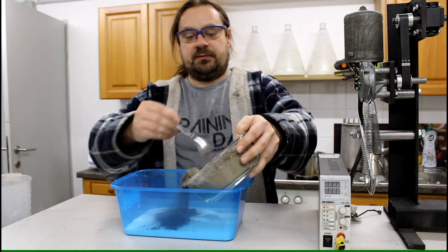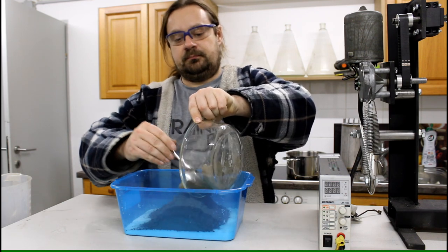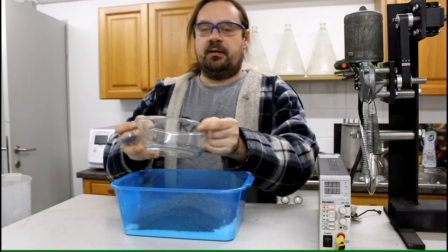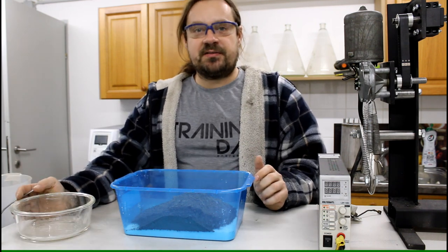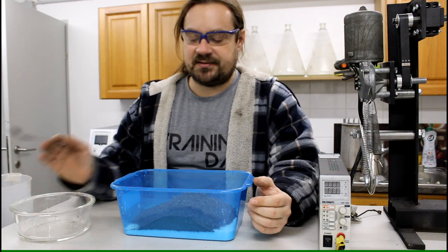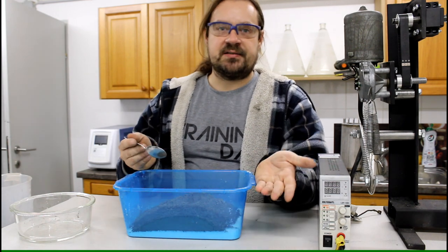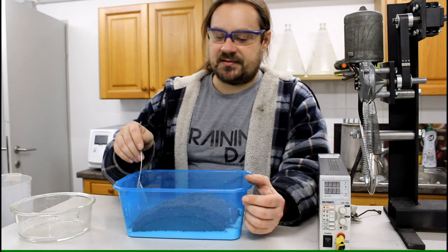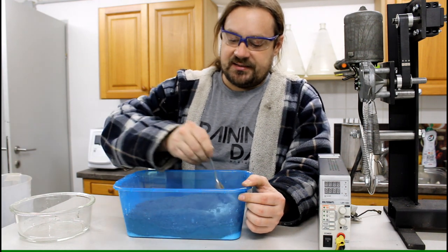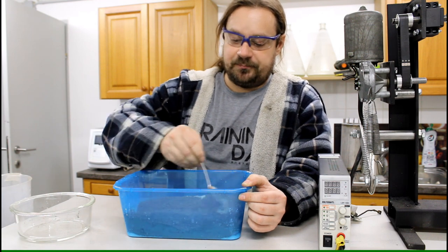Now we are going to mix that stuff in here. When you're handling sodium hydroxide, it's very important to wear glasses, because if that stuff gets in your eyes, it's a big mess. On your hand it's not so bad, but in your eyes it's very bad actually. Okay, so now we are mixing that stuff through with a spoon. Metal spoon doesn't matter.